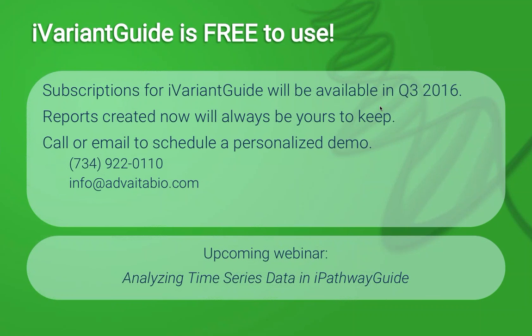Here's an interesting question, and I think it's a good one. Do you have an alternative palette available for colorblind customers? That's a great question, and I wish the answer was yes. But it's good feedback, and that's something that we can work on. While it's in beta, we appreciate any kind of questions or comments about that. We'll definitely take those into consideration and see if we can include those in the commercial release.